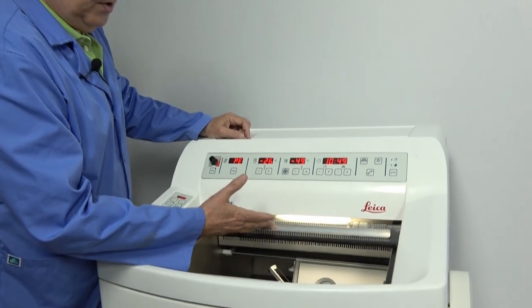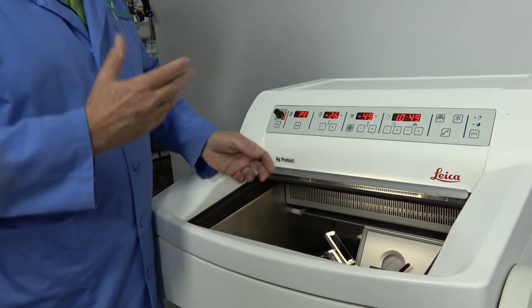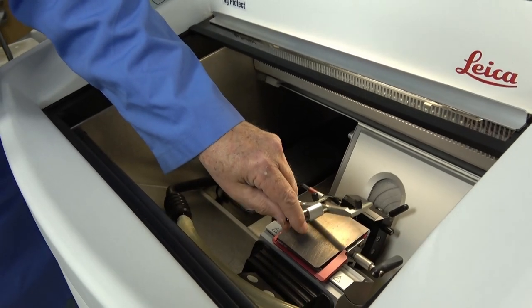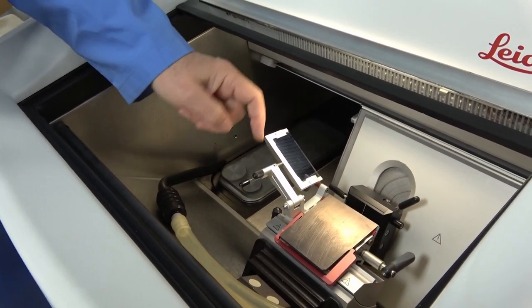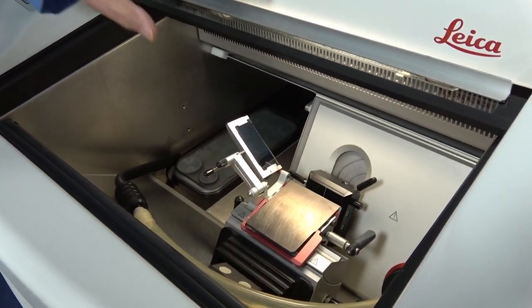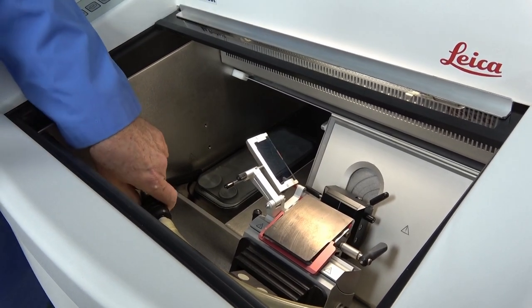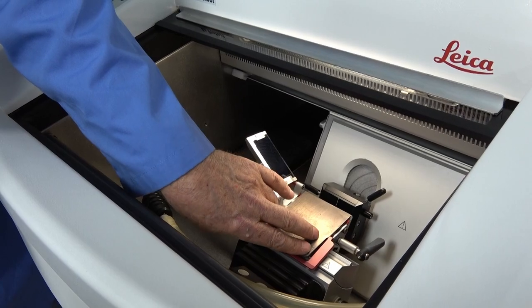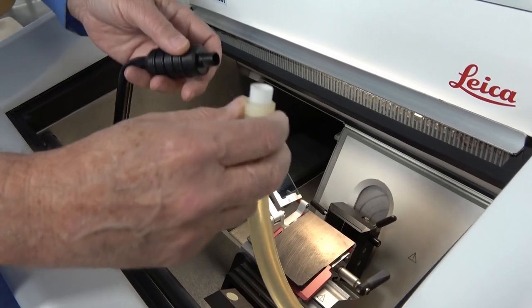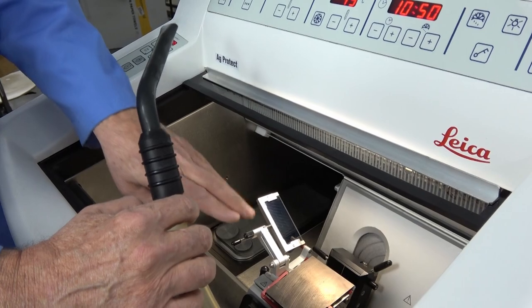When buying a used system, you may not have a totally complete system — this is a perfect example. You may not buy a system that has an anti-roll plate assembly or the glass, but this particular one does. While this is a vacutome system, it does not have the vacutome attachment that would snap on here and snip into this hose. It does have the workings for it and it does work, but it doesn't have that attachment.